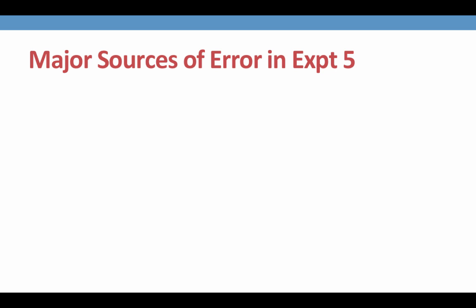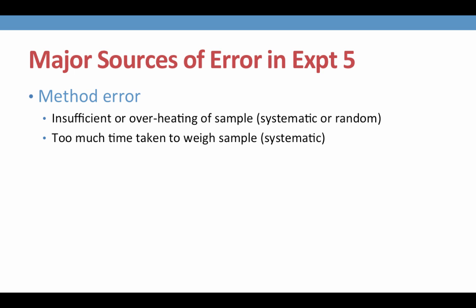In specific, there are several sources of error that come from experiment 5. The method error could be involved in not heating to constant weight, so insufficient heating of the sample. Insufficient heating of the sample would be a systematic error, since not heating to constant weight will always give us a lower percent hydrate, lower percent water in our hydrate, than if we did heat to constant weight.